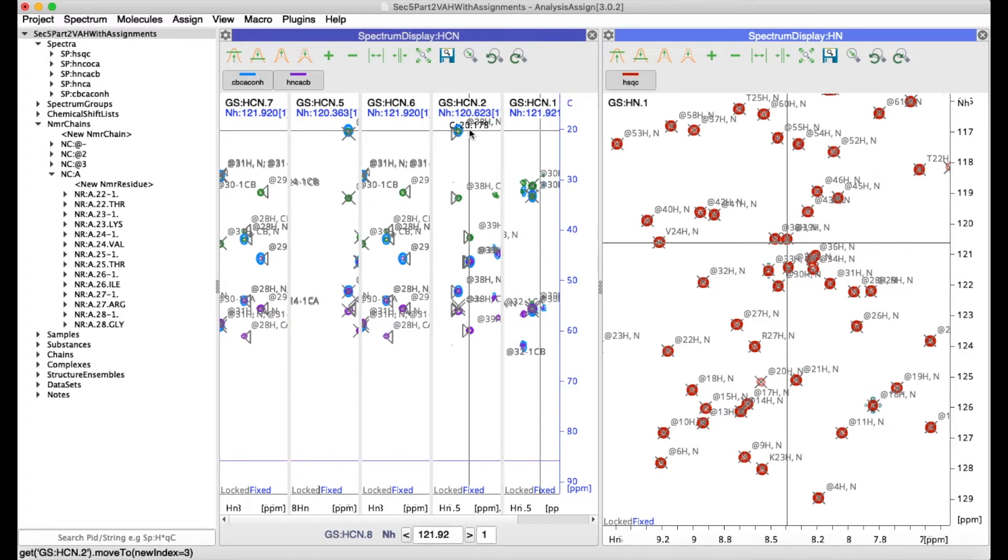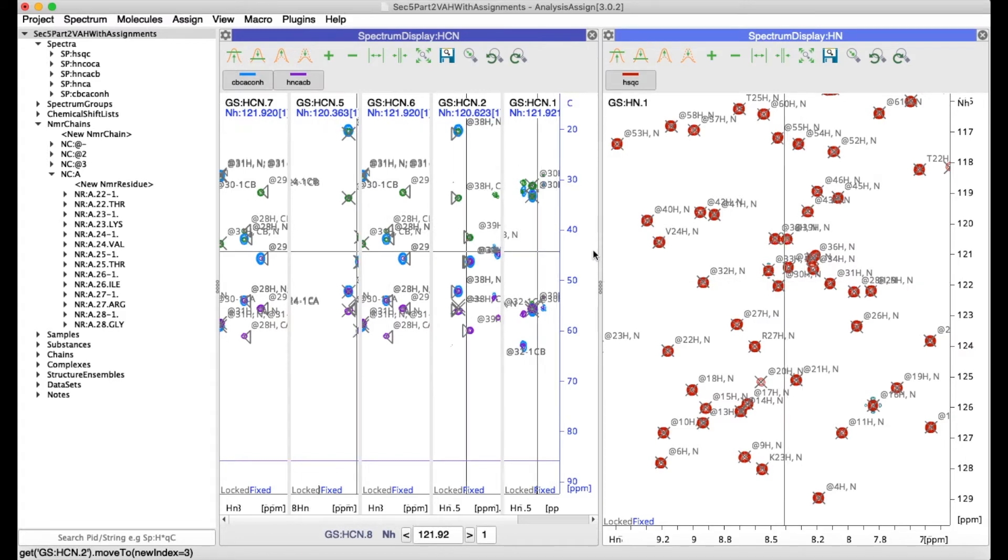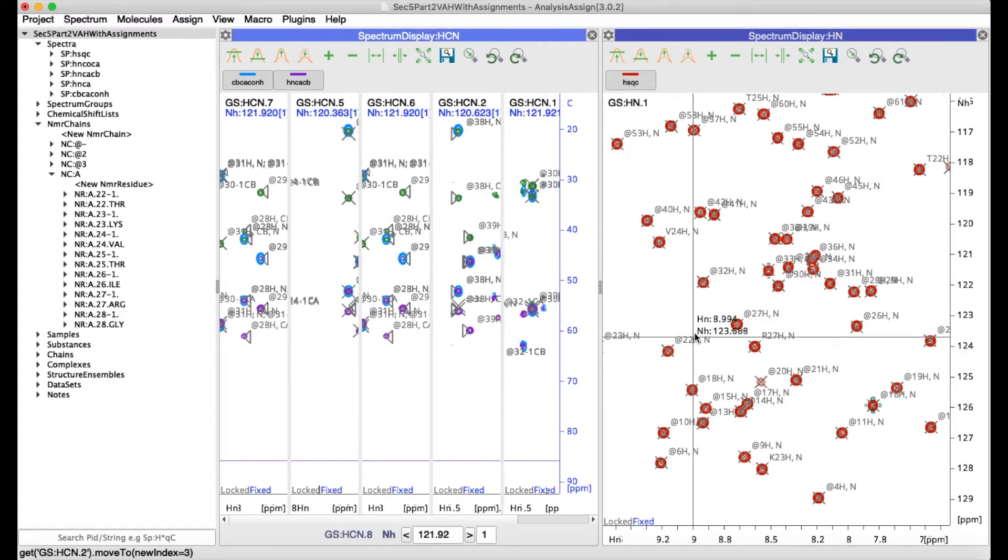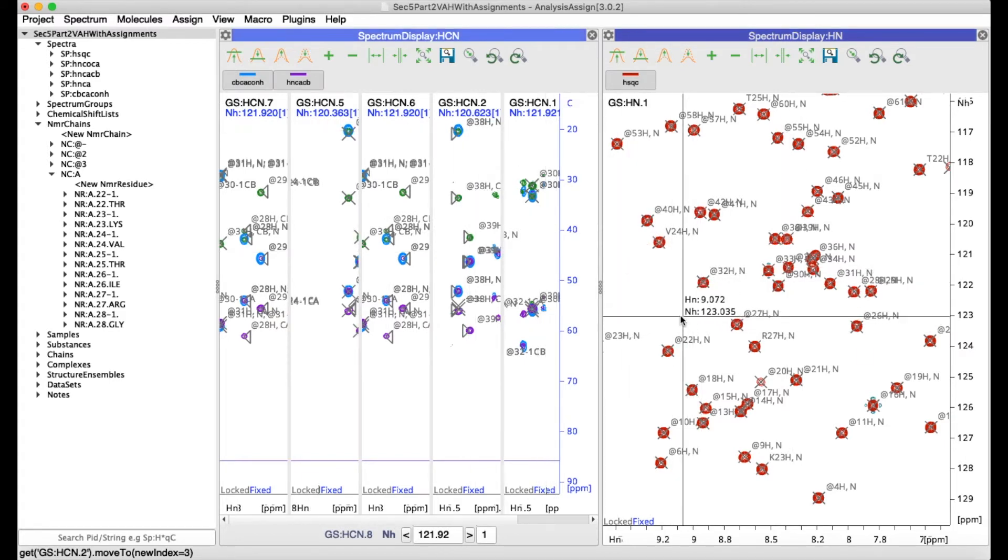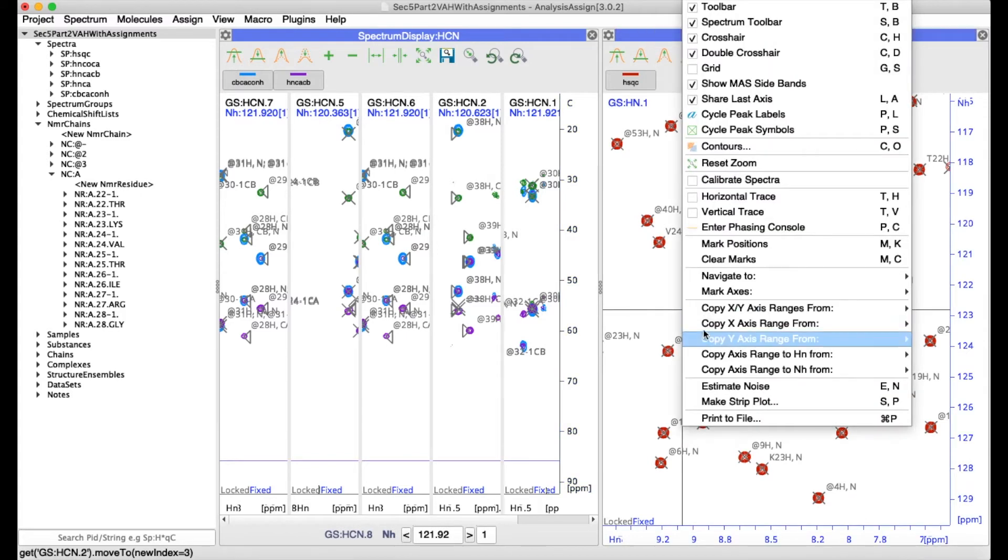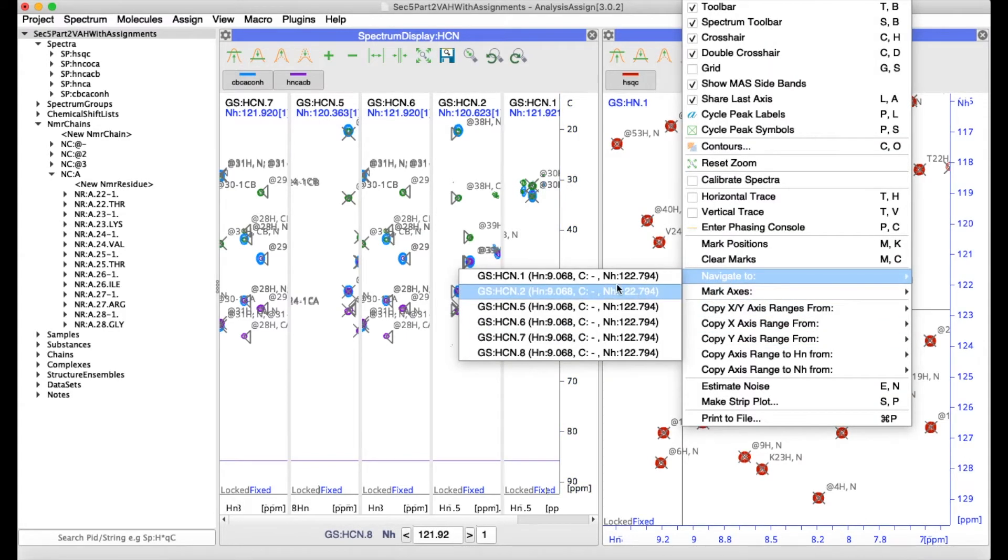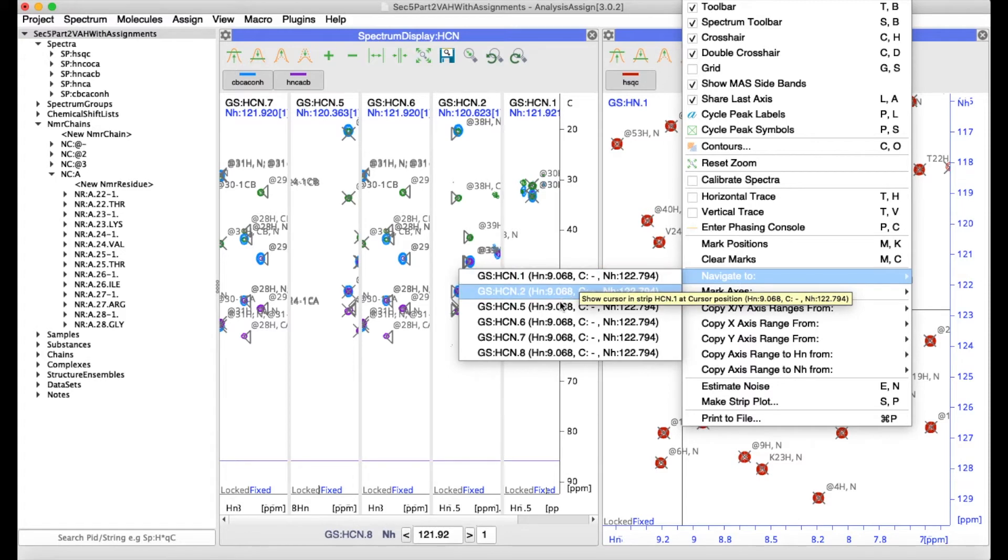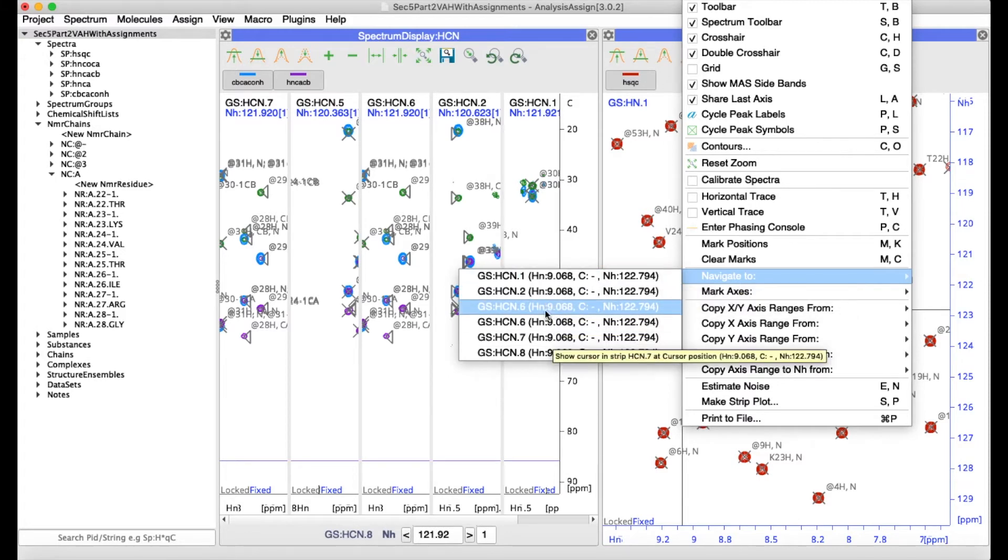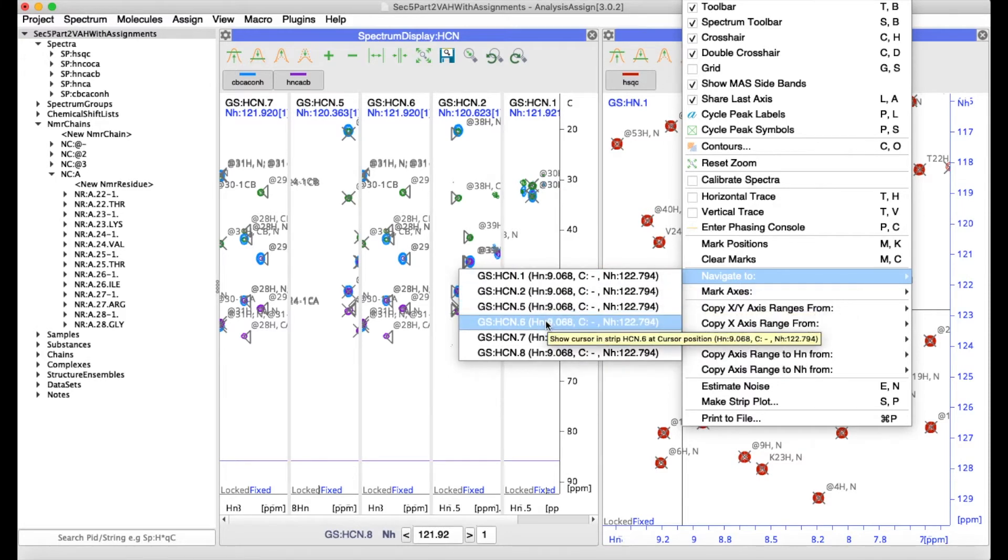You can navigate to a strip position from another spectrum display simply by going to navigate to and then select the strip of your choice.